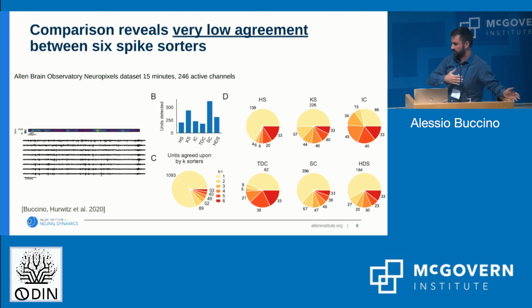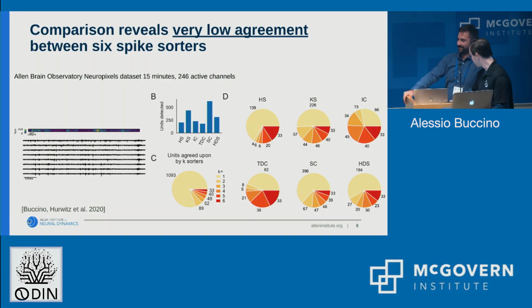How should I approach this? Is it one recording, or should I split this up and then try to connect the dots? The other problem is that if you split it up, then you're facing the problem of how you connect the units found in the different sessions. You could do some overlap and try to do some matching and so on. It's still, I would say, very ongoing and under development. Contrastive learning, maybe that could help with this problem. I'm happy to chat. Could be interesting. Thank you.